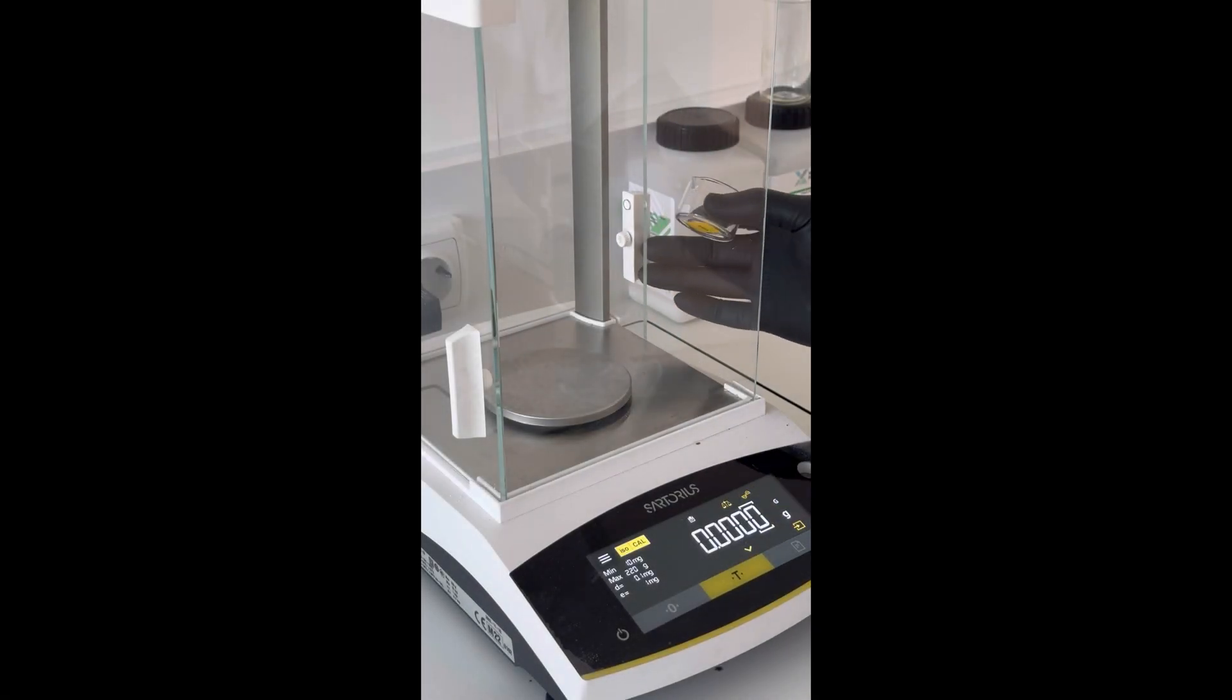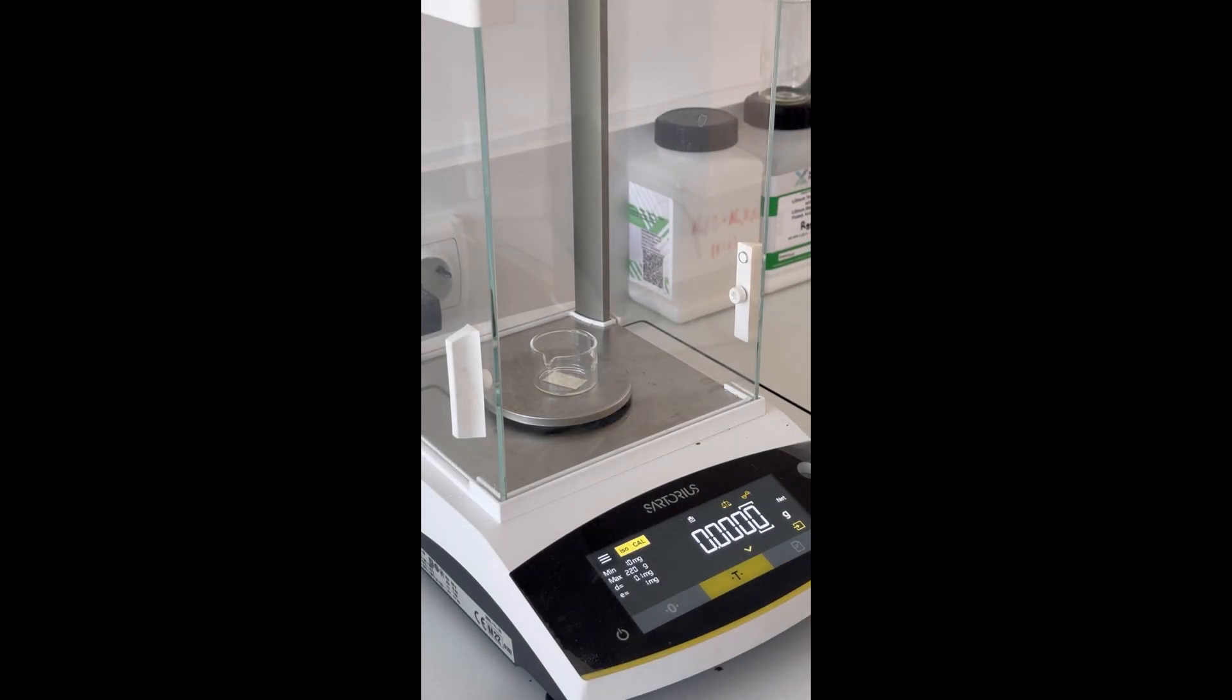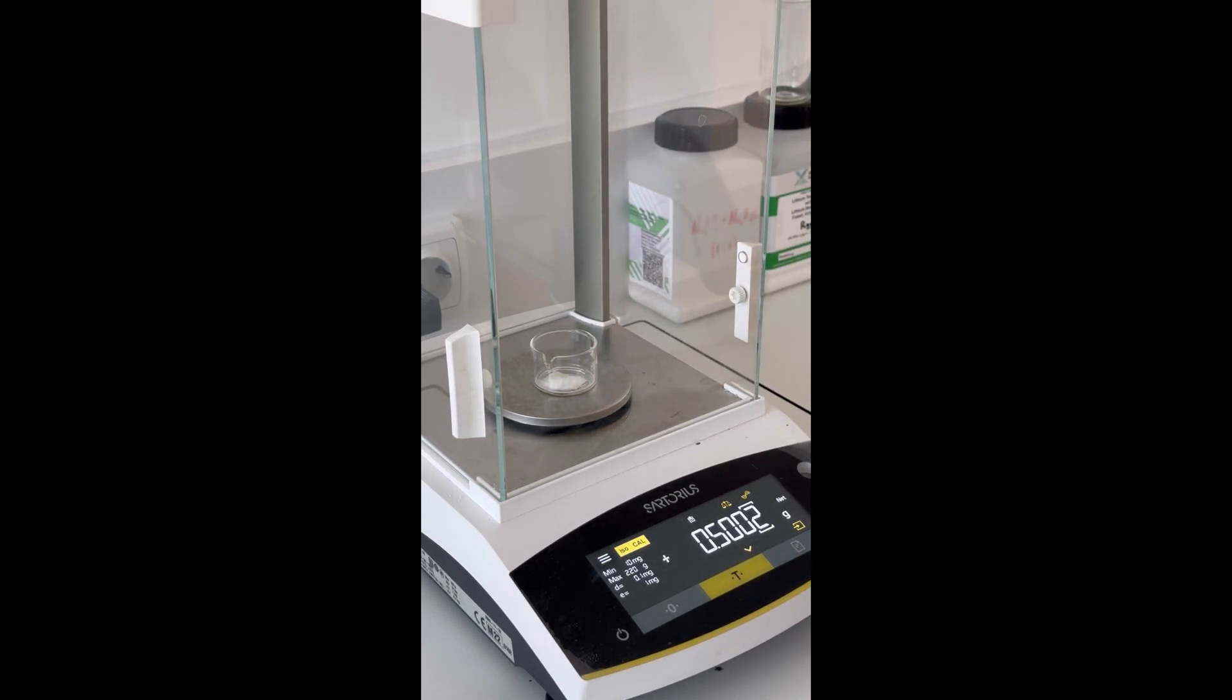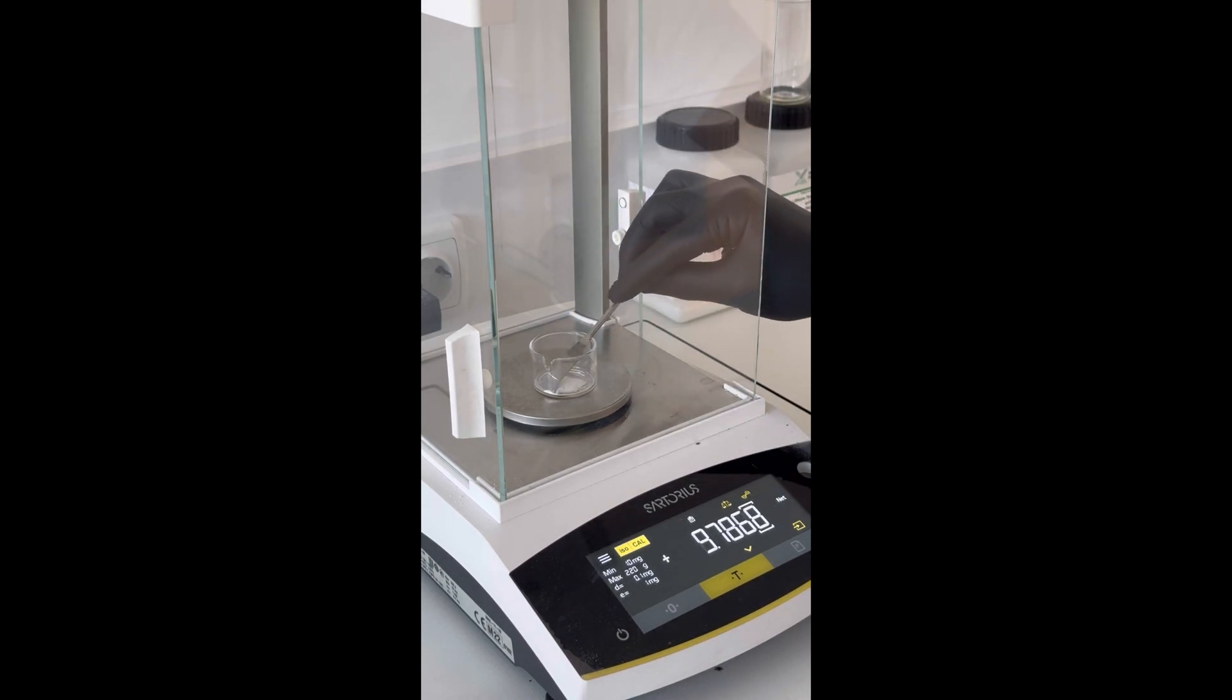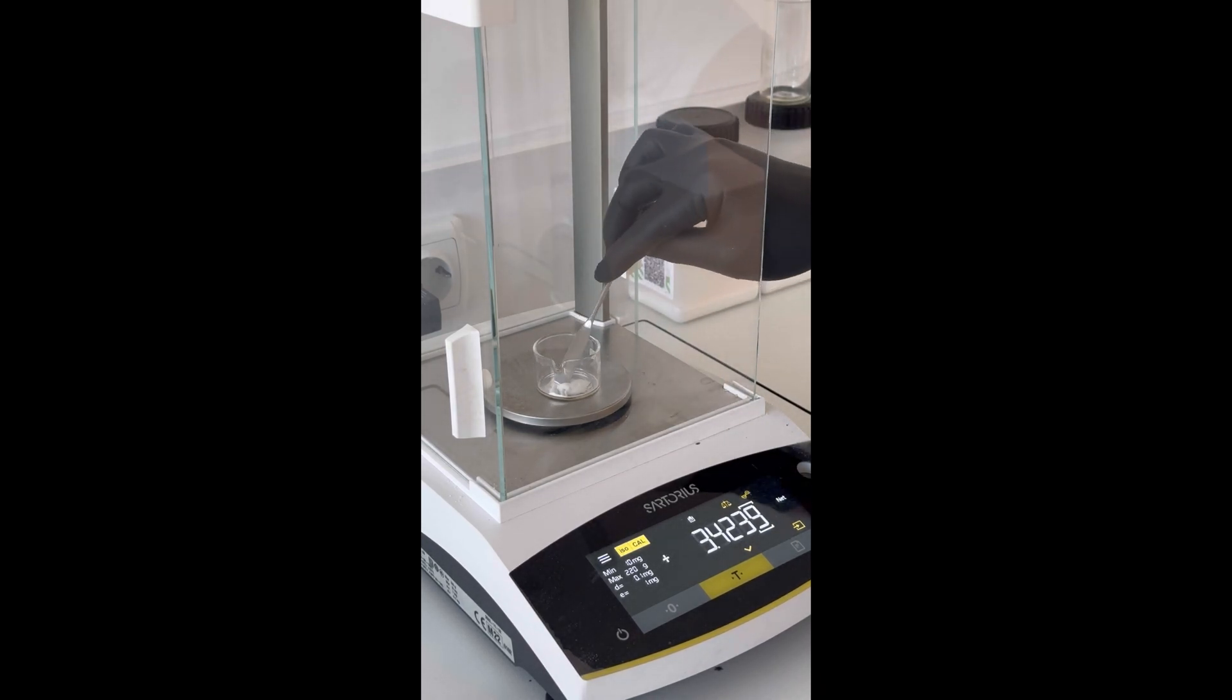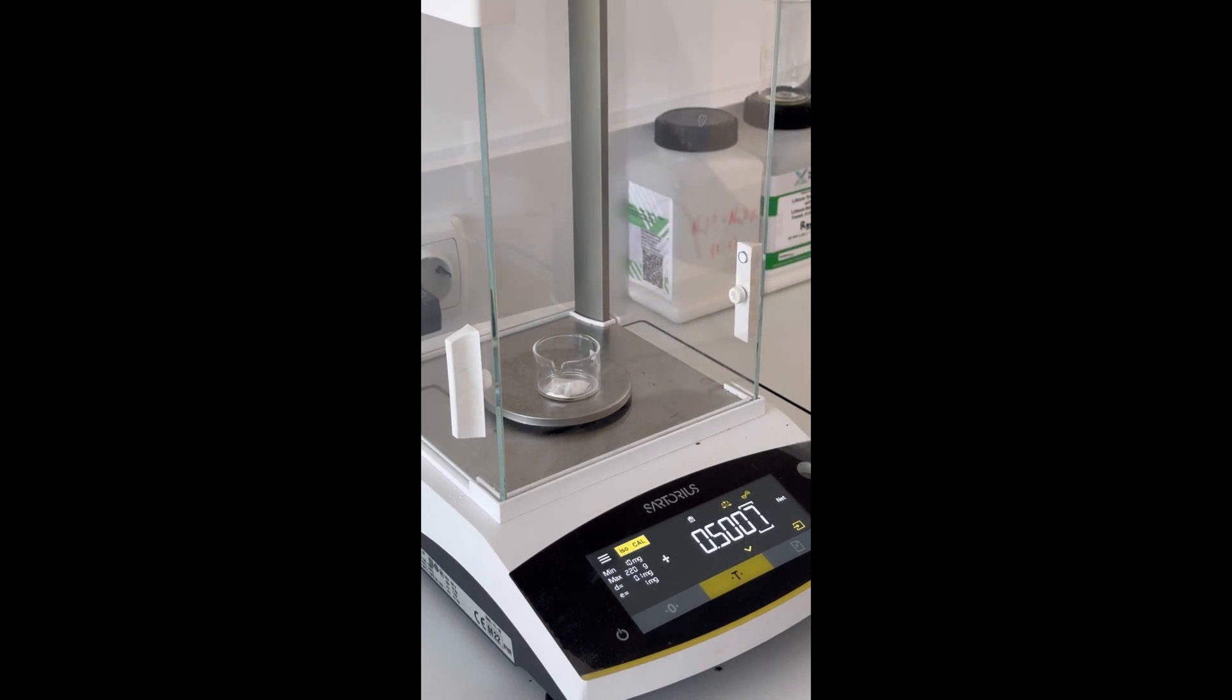For determination of the exact concentration of the solution, we weigh 0.5004 grams of dried calcium carbonate. It is important to be as precise as possible, allowing not more than 0.0001 grams of deviation.